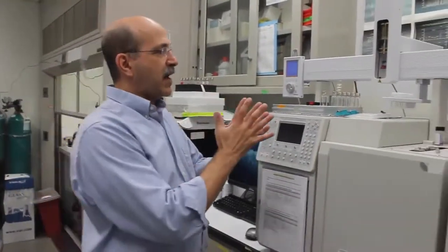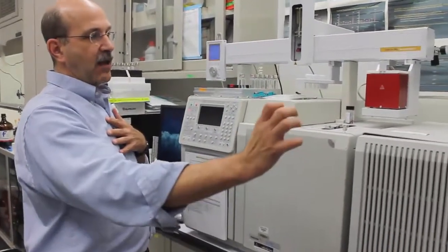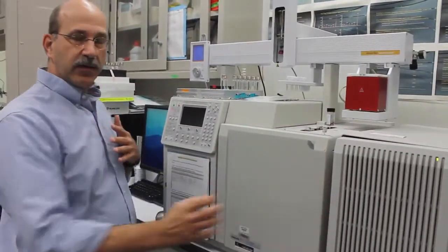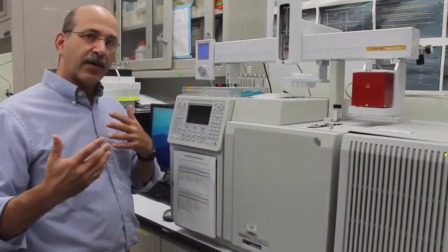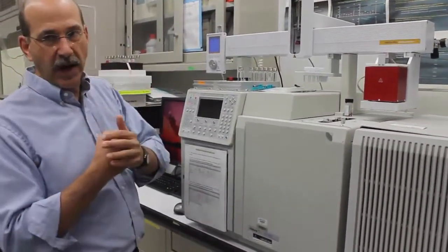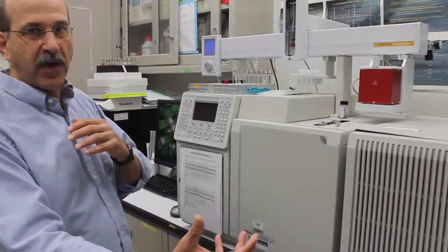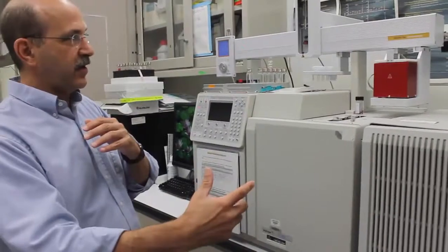Once we have the compound in place, we can analyze it and we can determine unknowns by selecting against a library. So the mass spec might create a fingerprint just like you and I have fingerprints, and we use that fingerprint in comparison to a library of compounds to determine what the unknowns are.